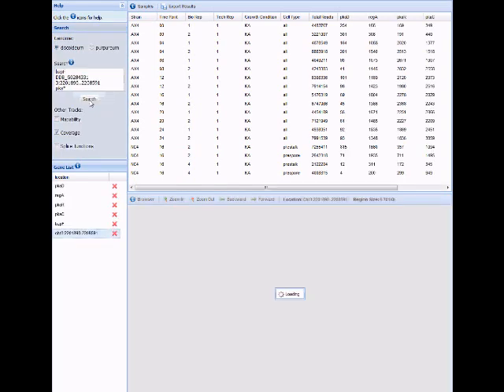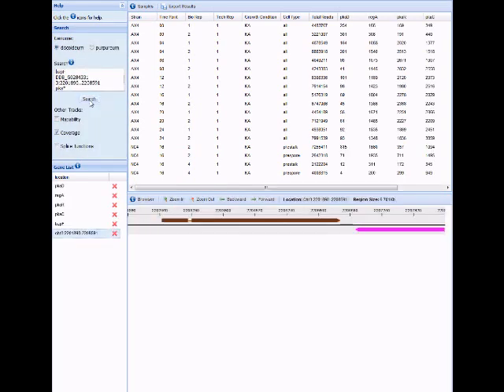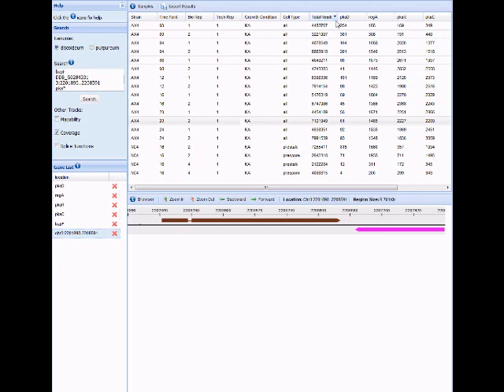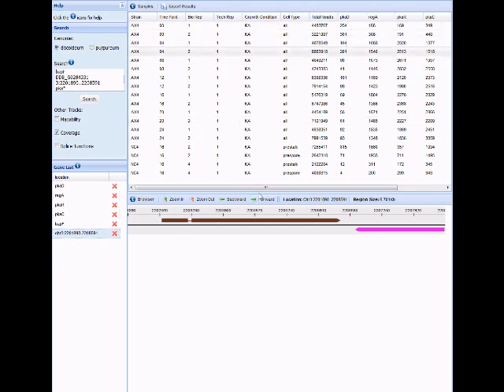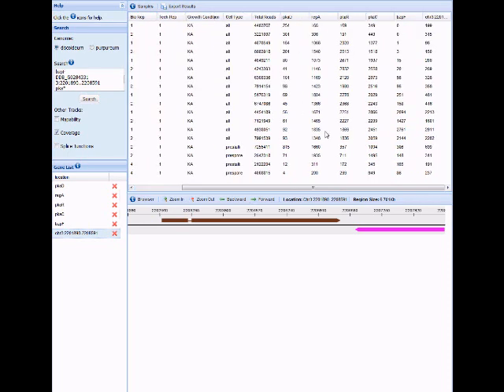When you search, a few things happen. The gene list panel returns the list of results from your search. The sample panel adds a column for each one of your results and the read counts across the samples for each of your results.